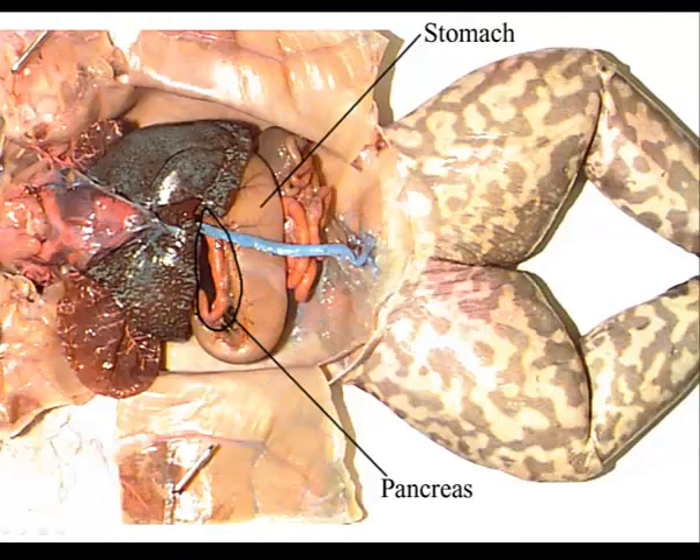This finger-like projection on top of the stomach, located along the mesentery near the small intestine, is your pancreas. It's a yellowish ribbon organ between the stomach and the small intestine. You should be looking on top of the stomach to see the pancreas.